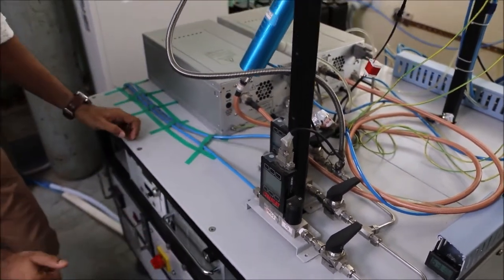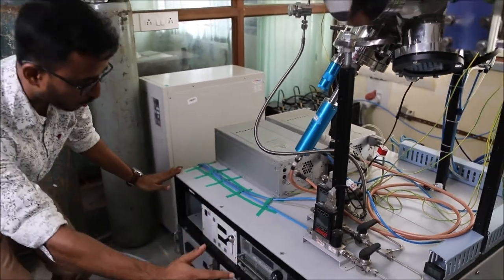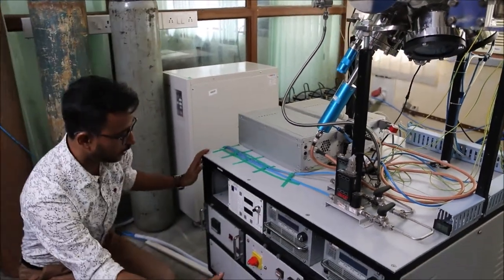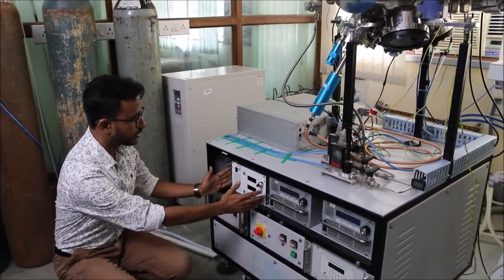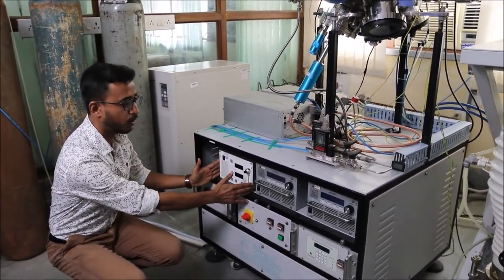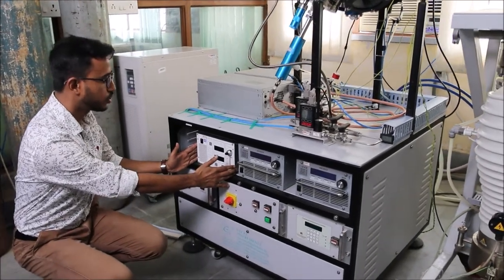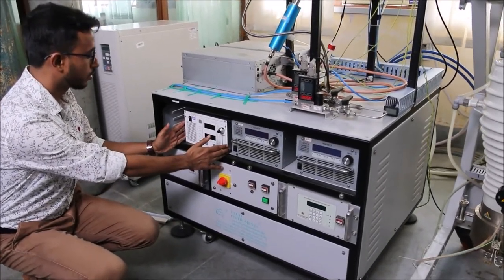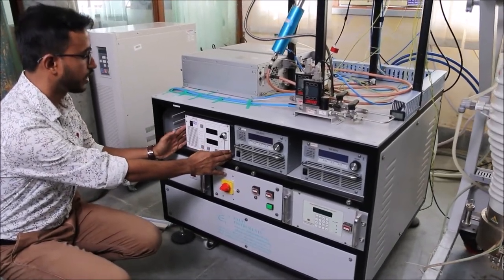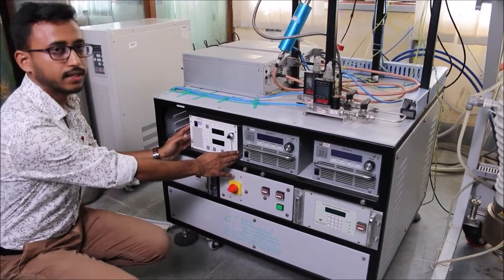At the bottom, we have the power sources. First, this is the DC power source, which is mostly used for metal targets.